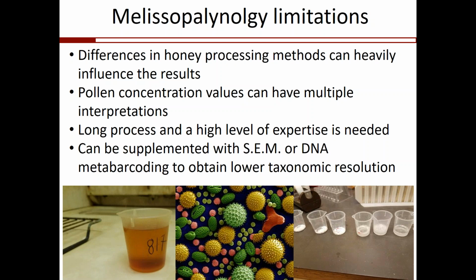So we saw almost half of our samples were category 1 pollen honey types. And that can mean a lot of things. We can't say that honey was adulterated because maybe the bees were just foraging on sugar water throughout that time. Maybe they were scavenging in trash cans. Or maybe the honey sample was filtered to an extent. Any of those could have contributed to our high number of category 1 honey types.